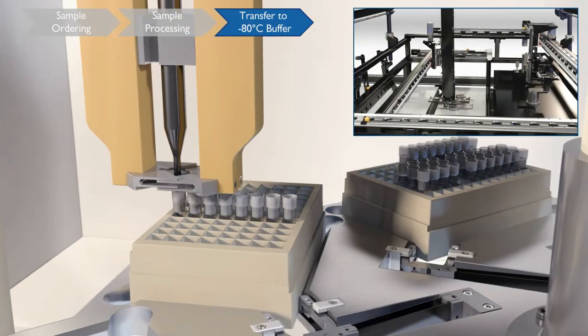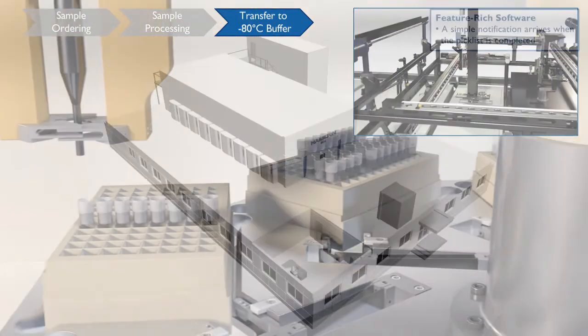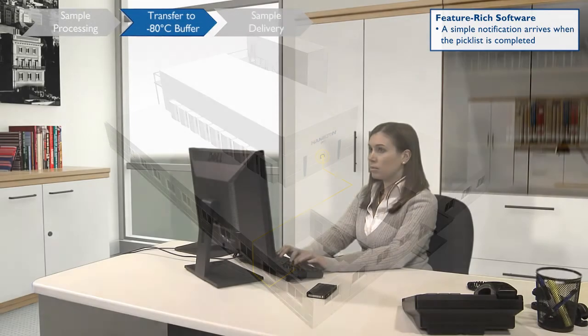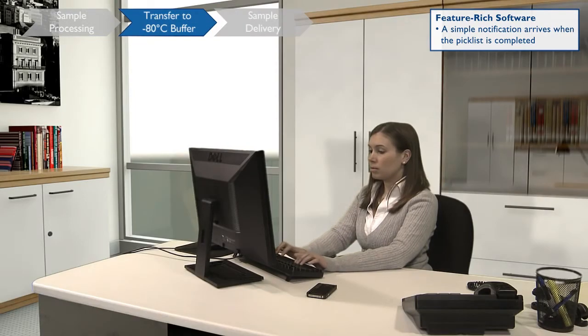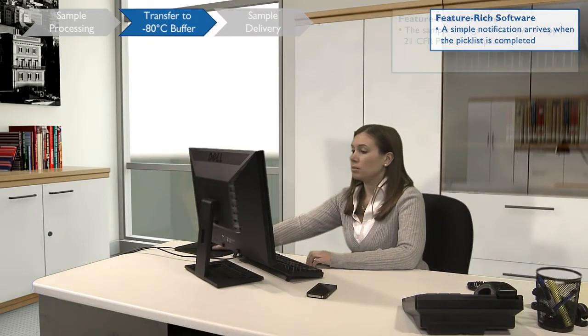Samples are stored in the negative 80 degrees output buffer waiting to be picked up. BIOS will notify you when your samples are ready for pickup.